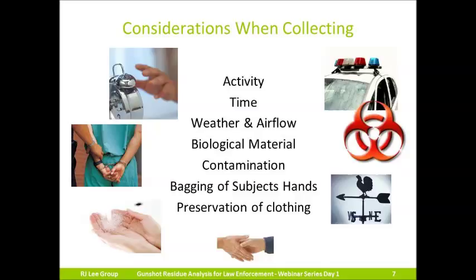If you will be collecting samples at your agency, be sure to wear gloves and ensure a clean environment. For example, don't collect samples in a ballistics unit, and clean surfaces before the subject is brought in for sampling. Make sure to lay out paper, and do things that will prevent contamination.